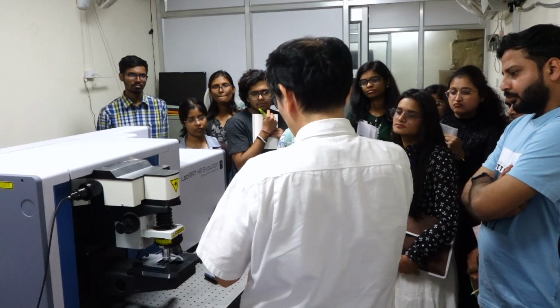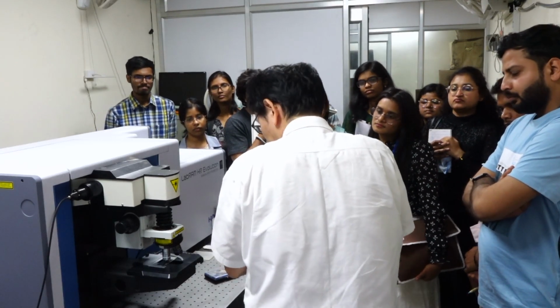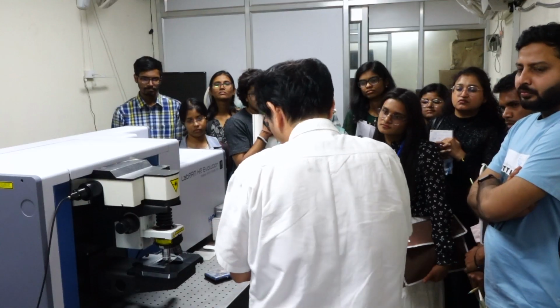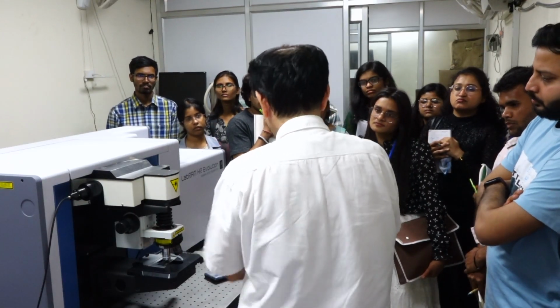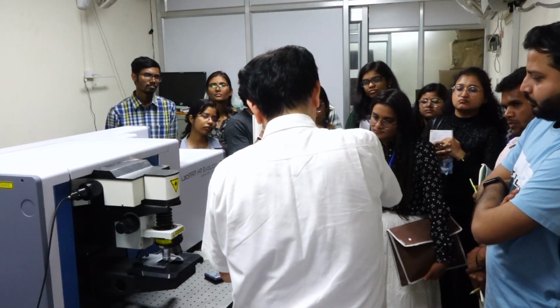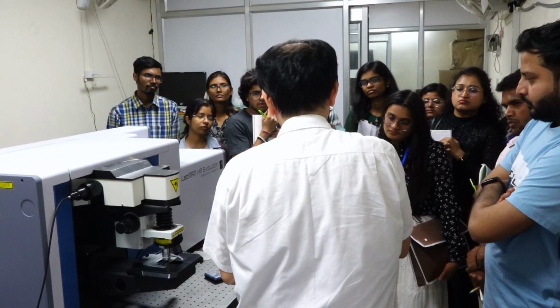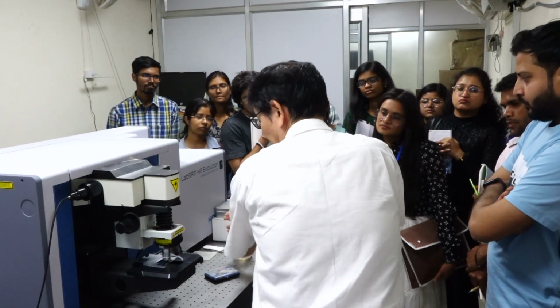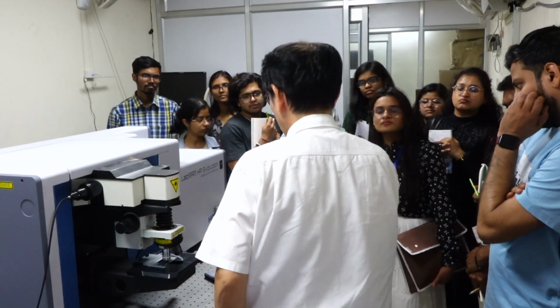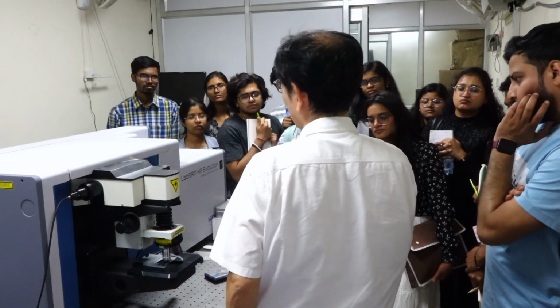So it is used to focus the laser beam onto small spots, and at the same time, this lens collects the scattered signal from the top. In this sense, we illuminate from the top, and we detect the backscattering beam. So this is the backscattering configuration. Both work, 90-degree detection and backscattering detection. We get the same information.